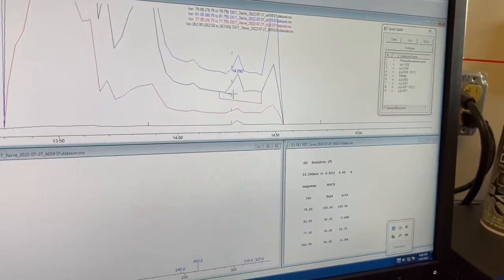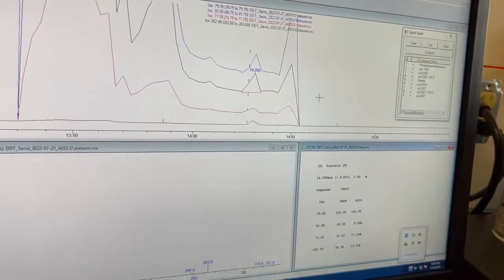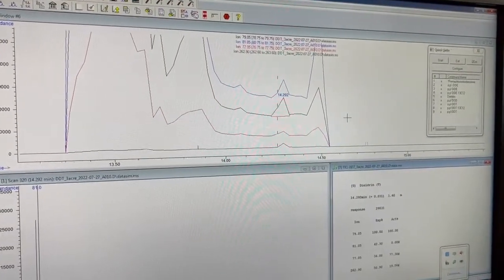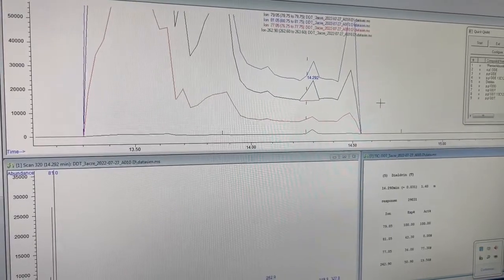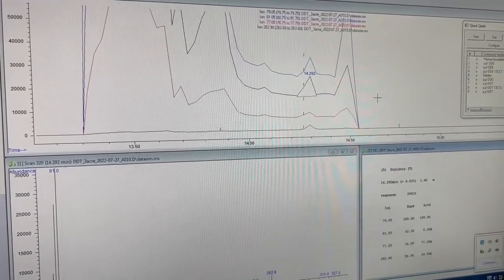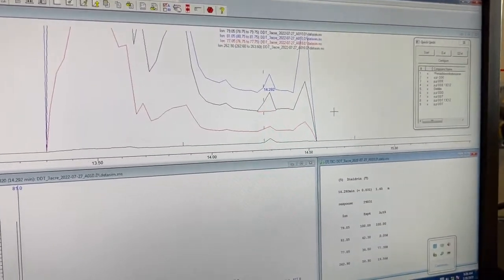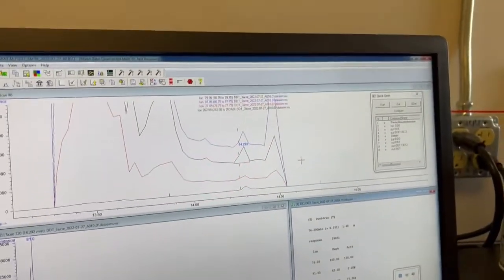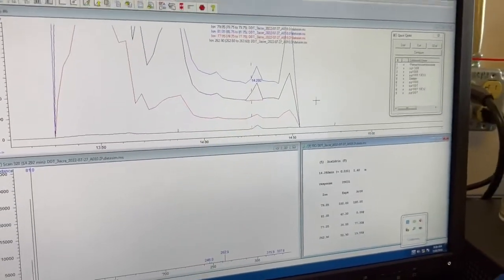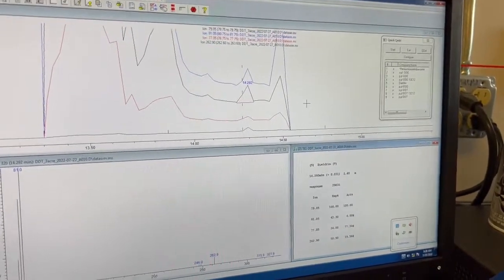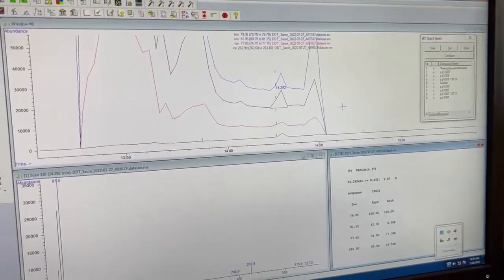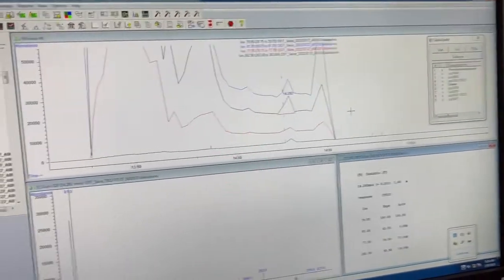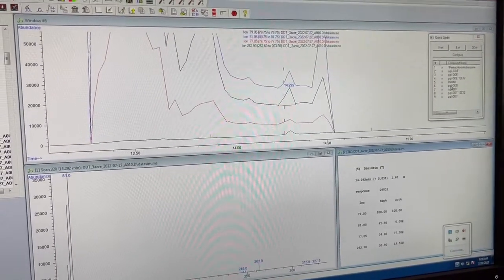So for the very small concentration, it is very sensitive. So I think when you are doing this, you want to make sure this is consistent. All the blood. And if you can't really see it clearly enough, you just kind of have to count it as thought there. Like it's also going to be in a very low concentration. Like we would expect Dildren to be in a low concentration. And so if we see this super high, it's a problem.